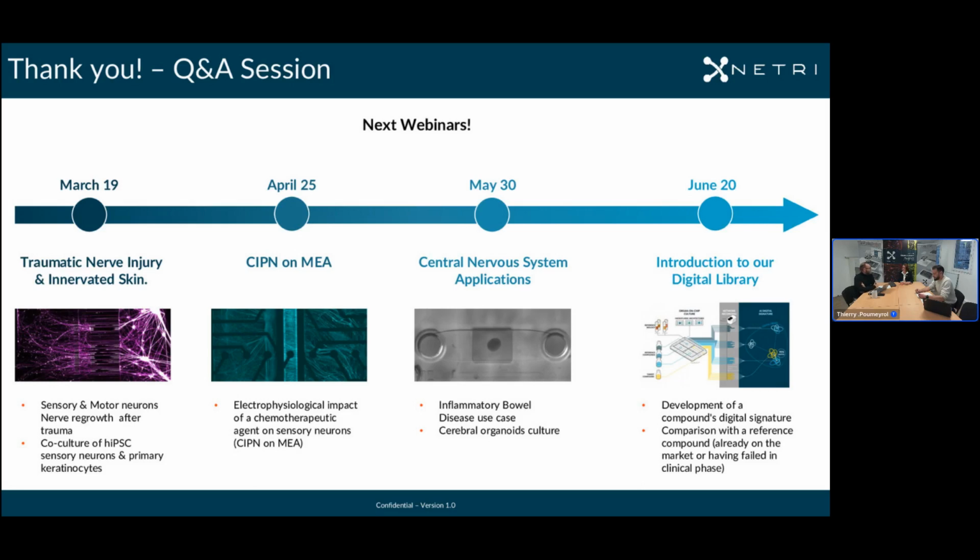So this will be feasible. However, for the way to sample, you will need to take into account that we are in microfluidics, so there is flow, and we have an engineering team that has developed ways to take fluids to ensure that either you have all of it or just part of it, or how to do repeat sampling.